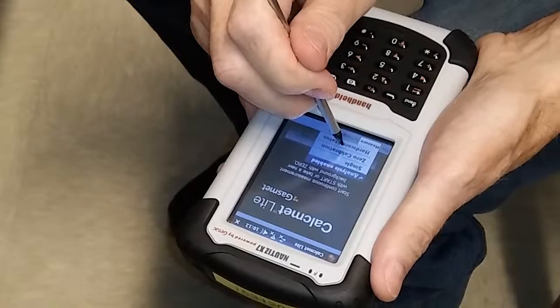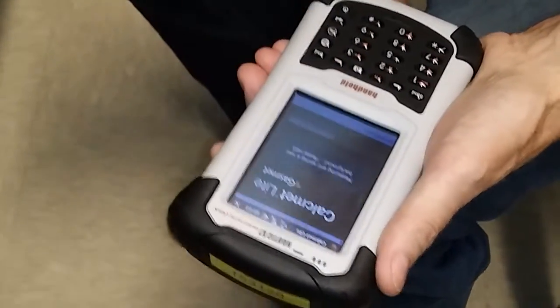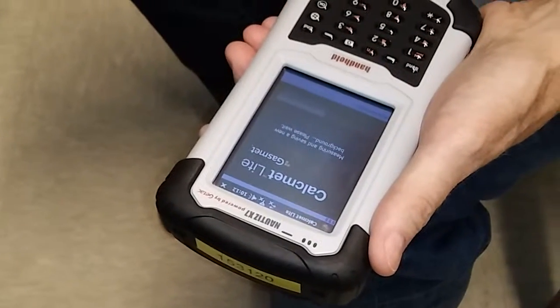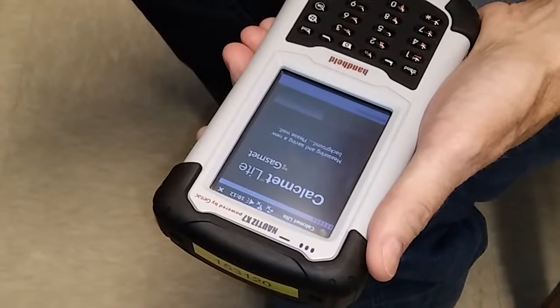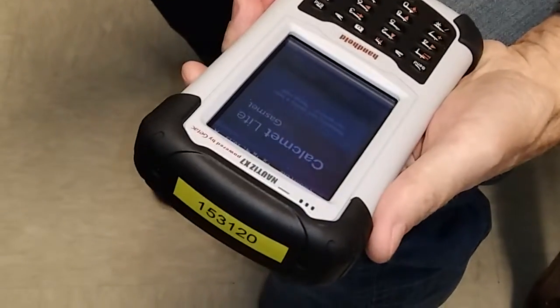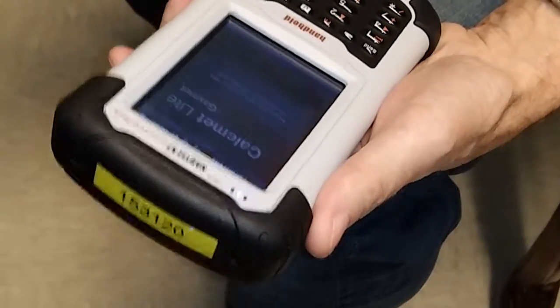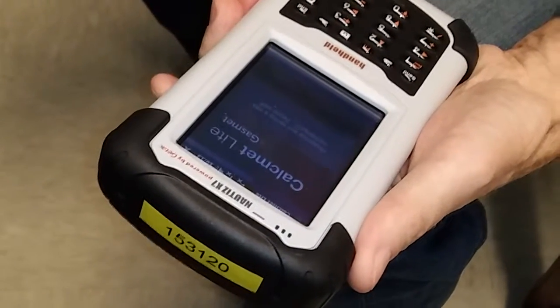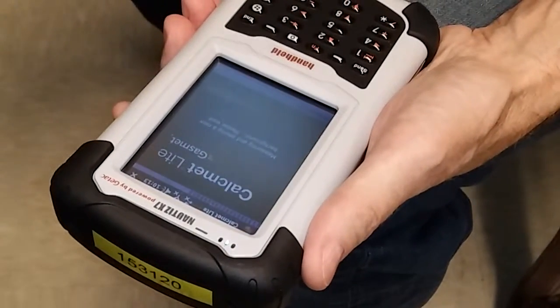It says 0 calibration. Do another 0 cal. Please wait and see if this will set up better. Doesn't go into the cell. That's what I'm confused about. If it's doing a calibration, you don't hear the pump. I don't know. If it goes back to 0, can't go back to factory settings.